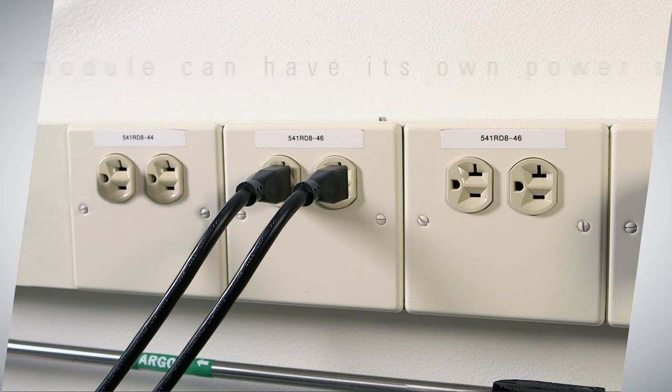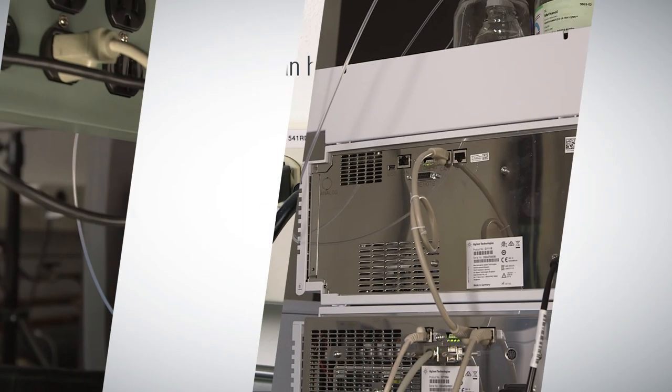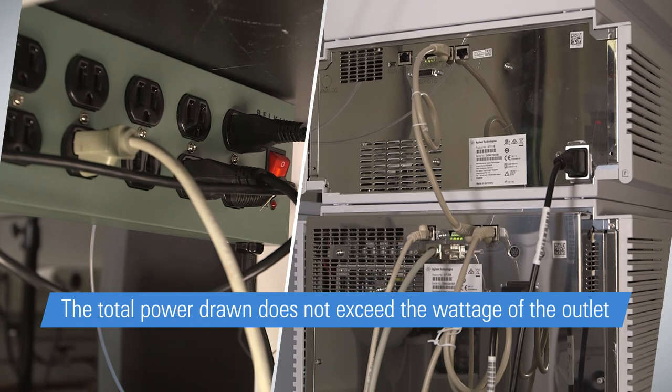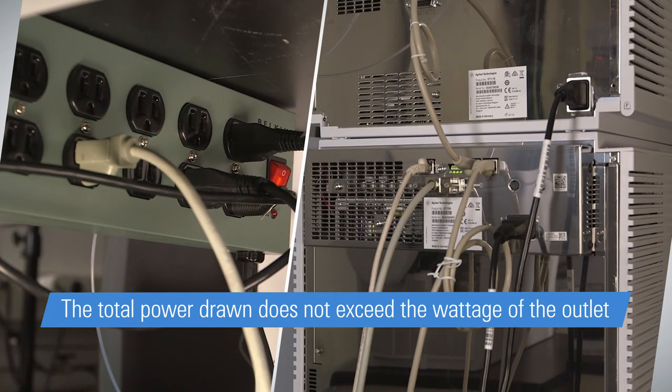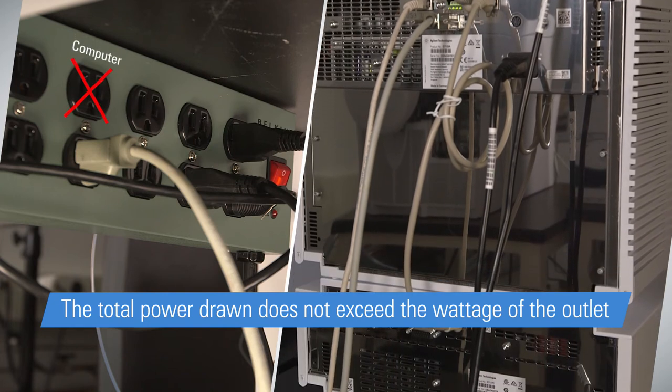Avoiding Chris's power consumption mistake is easy. Install your LC in an area where each module can have its own dedicated power socket. Remember to leave an outlet for the computer and monitor. If necessary, a power strip can be utilized, but you will want to be sure the total power drawn does not exceed the wattage of the outlet. For example, you will not want to add a printer to the same power strip as a computer and monitor.